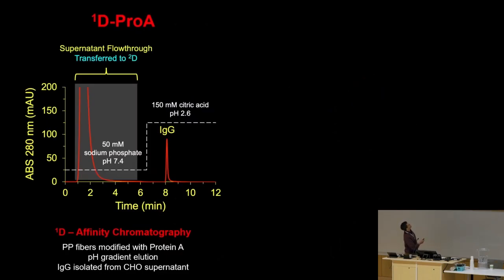There's a little chromatogram of the 1D separation, so absorbance on the y-axis, time on the x. And so this gray box is the transfer window. So during this transfer window, the flow rate of the 1D pump was 0.1 mL per minute, while the flow rate in the second dimension was kept constant at 0.5. And so this was just due to our limitations, not having active solvent modulation, not having 2D software, having to program all this manually, and just to facilitate the timing of things.